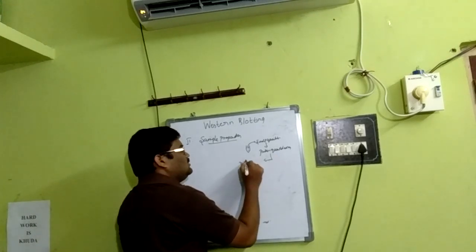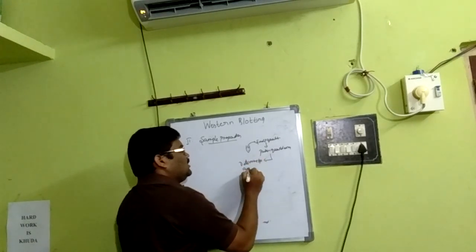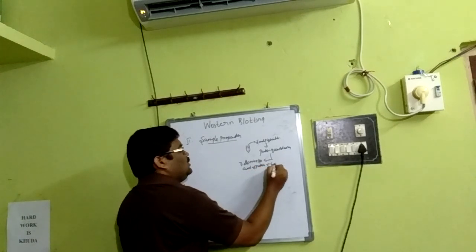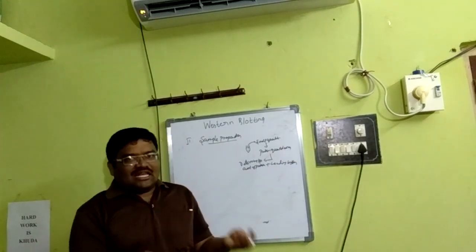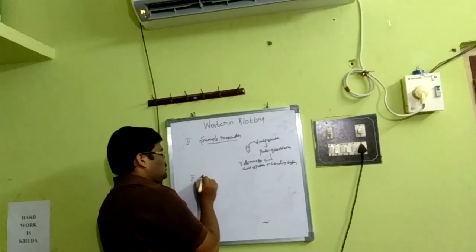Determine the amount of protein plus loading buffer. So I prepare the sample. That means ready for gel analysis. The third step is gel running.